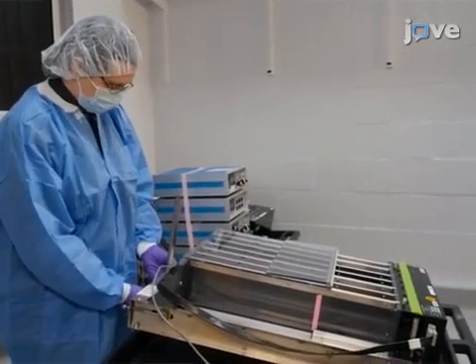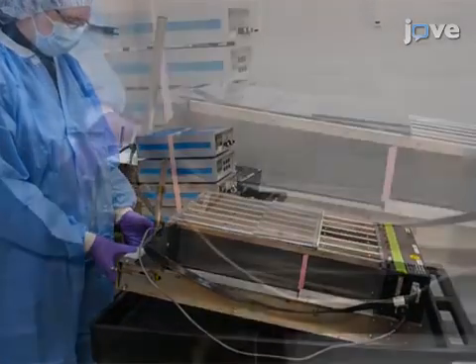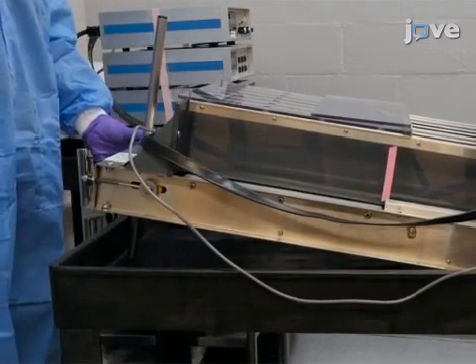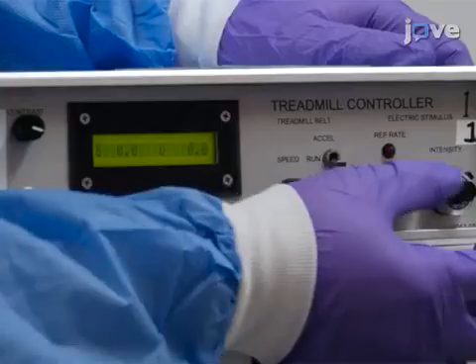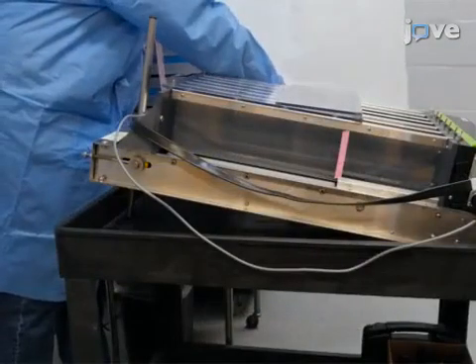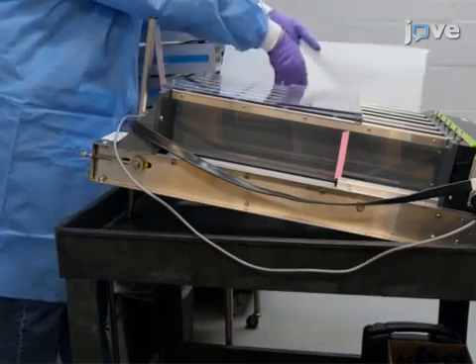Prior to training and testing mice, ensure that the treadmill is on a flat surface and set it to the desired angle of inclination, which is usually 10 degrees. Next, ensure that the electric shock frequency and intensity are set appropriately, which is usually 2 Hertz and 1.22 milliamps. Under the treadmill, place a piece of paper or an absorbent pad to collect feces and urine.